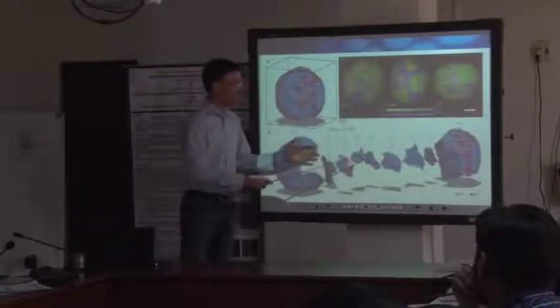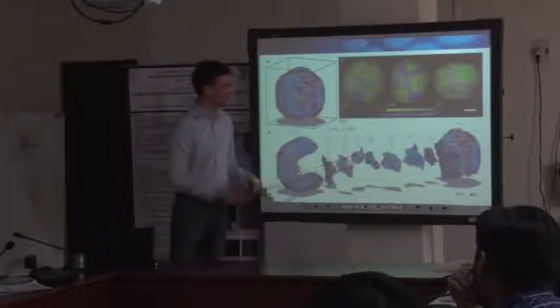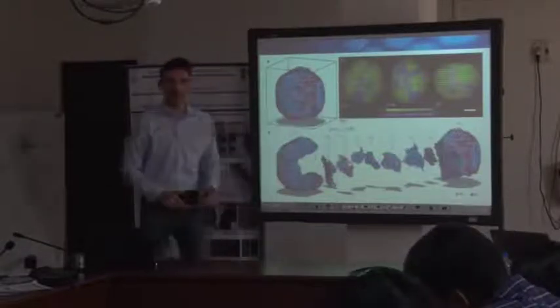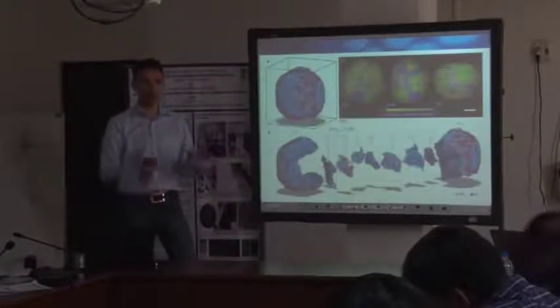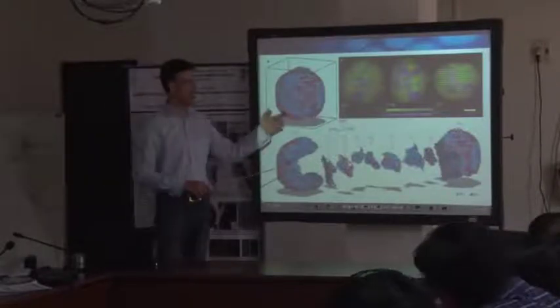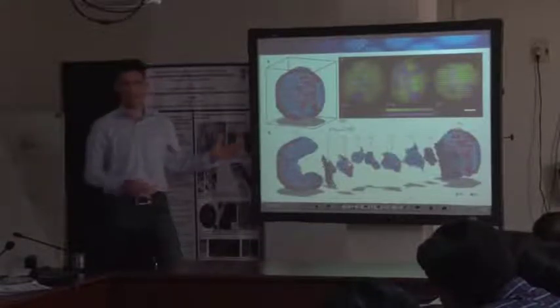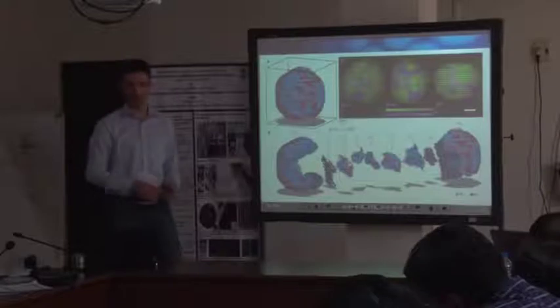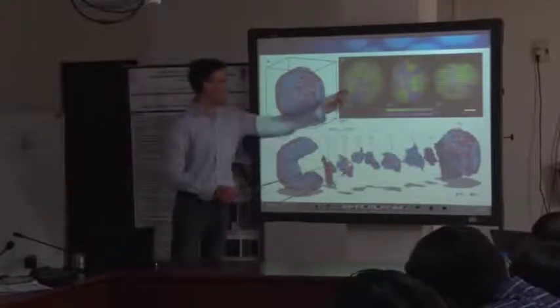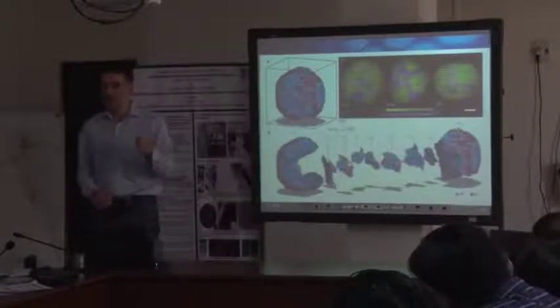And by that, people were able to separate those areas where the particle is highly ordered and other areas where the particle is highly disordered, down to the atomic scale. So these are 23,000 atoms. It's pretty elaborate work, there is important information like 30 pages or so. They were able to identify at each atomic site the nature of each atom.